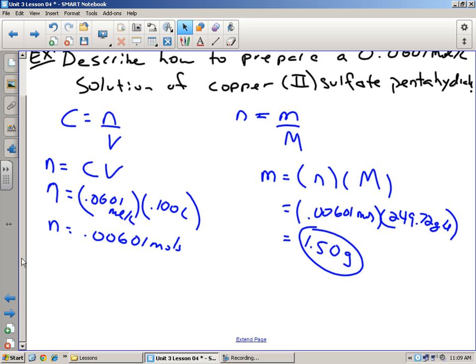And you might say, how long is this going to take? Well, as many times as it takes. But remember, this is 40 milliliters at a time, roughly. It's actually 50, but 40 is the marking on here. If you do 50 twice, full up, well, that's 100, and you're done. So you have to be careful.